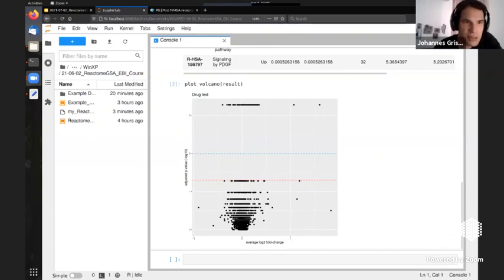Is it more correct to use edgeR or DESeq2 to calculate fold changes or DGE if we use raw counts? So in the backend, we actually use limma. And if you use edgeR or DESeq2, you know that edgeR and DESeq2 want raw counts as input as well in transcriptomics. So we do the same thing on our end. Don't forget, we do all the analysis on the pathway level, not the gene level. So yes, always try to use raw counts as input. In the edgeR and the DESeq2 vignette, they actually stress this quite a bit.